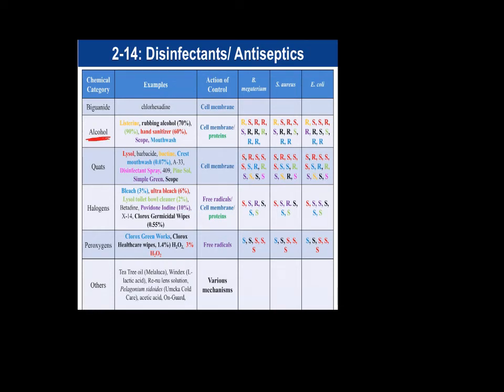So we had a number of different groups test a Lysol compound. And in my classes, I've had students test Lysol wipes or aerosol Lysol or the spray Lysol, and then sometimes it's a toilet bowl cleaner Lysol. So I don't know with Lysol what these groups tested. And there is, again, some variability among the groups.